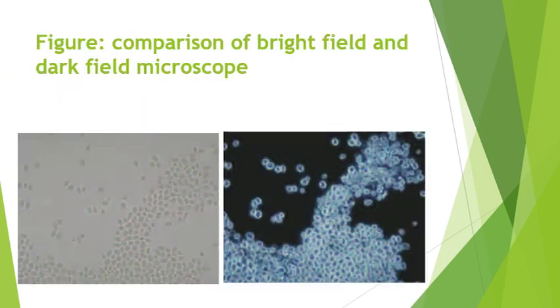So here we have a different view of bright field microscopy and dark field microscopy. In bright field microscopy we have a bright background, but in dark field microscopy we have a black, or dark, background.